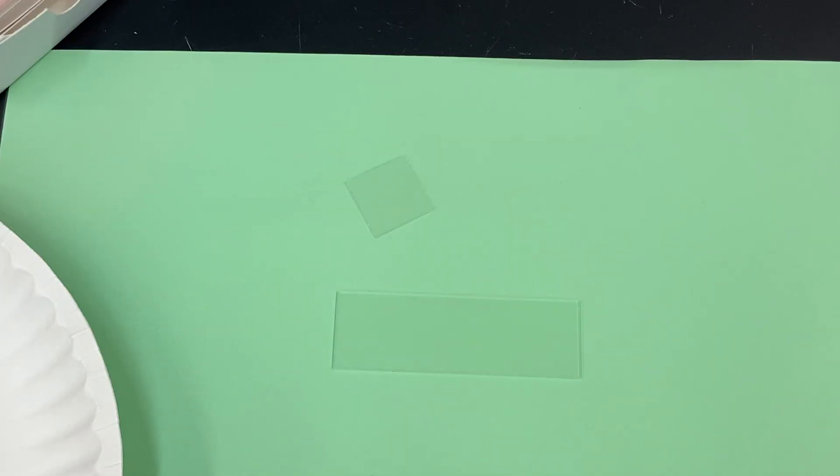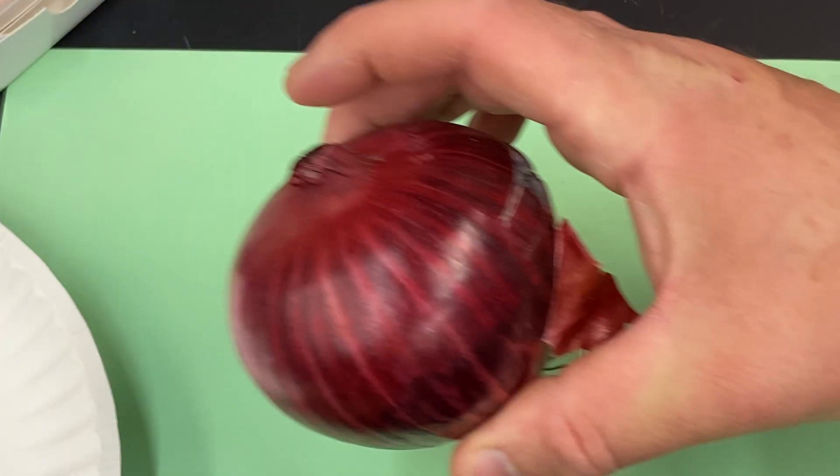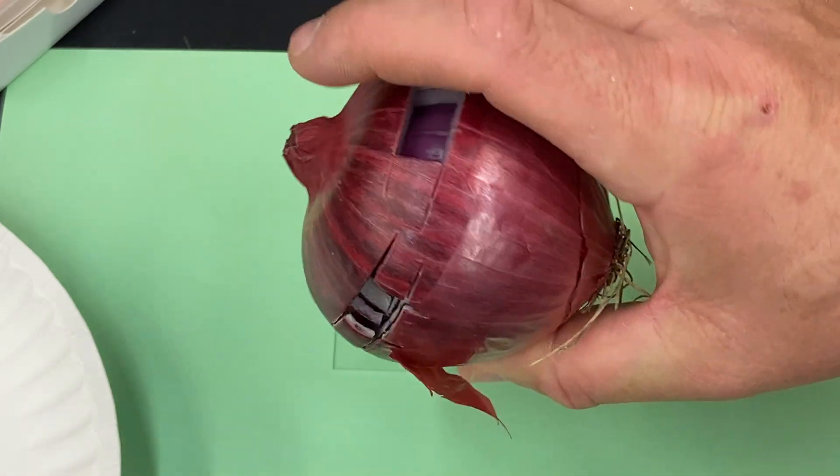The second portion of the diffusion through a membrane lab involves making a slide of our friend the red onion. I've cut some out already, some nice fresh red onion. So here's what we're going to do. I'm going to make the slide so you can watch how to properly create a wet mount.